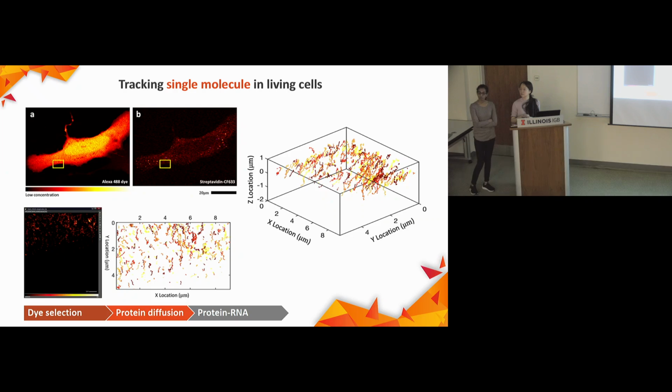Here you've got these search patterns with multiple steps, so for one location you've got 12 or 14 different photon count numbers in different locations. And with two detectors, you can make sure that the ratios between the two detectors are constant. Okay. Cool, thank you.